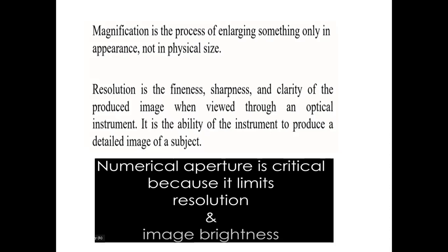As you can read, resolution is the fineness, sharpness, and clarity of the produced image when viewed through an optical instrument. Optical instrument here means the microscope. Let me explain it with two simple points.